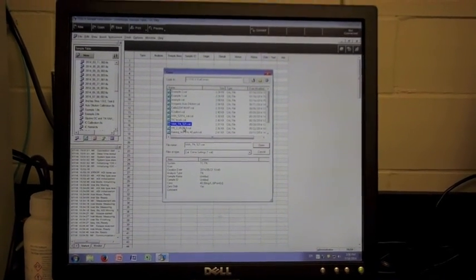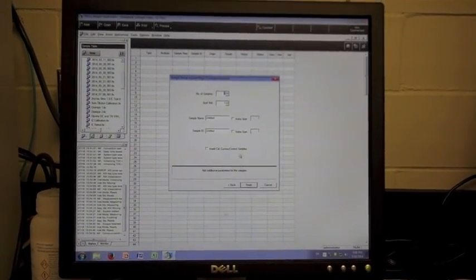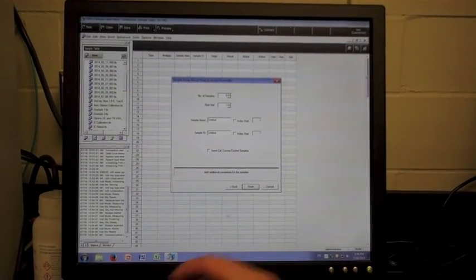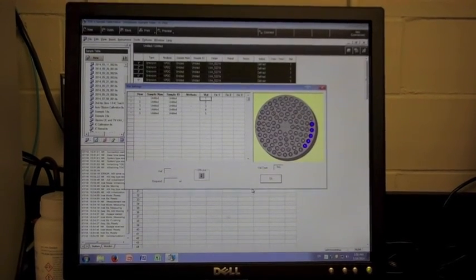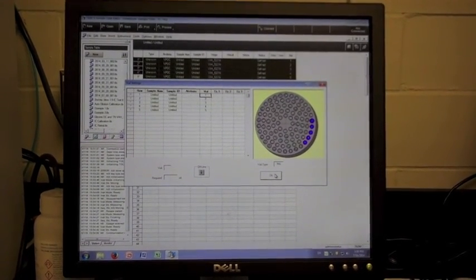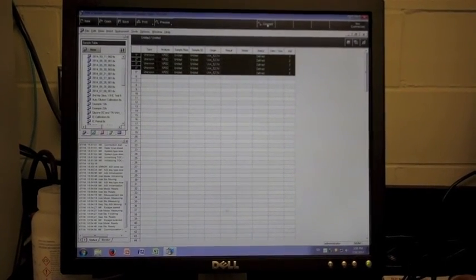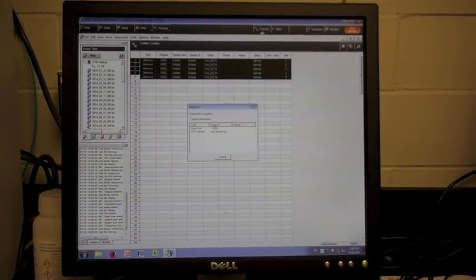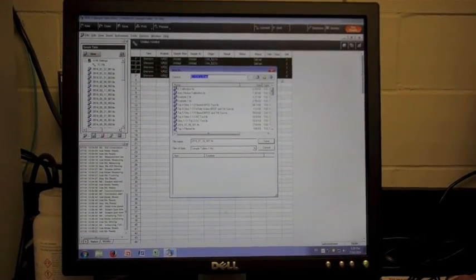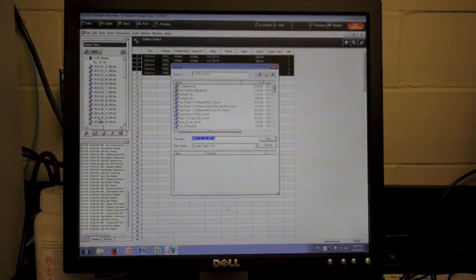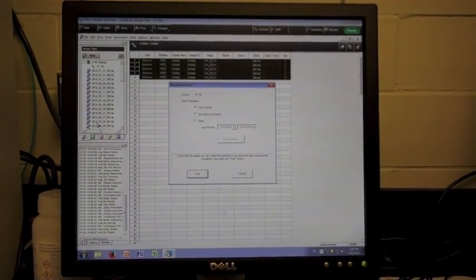Proceed to the next window and enter the number of sample vials and the vial number for which you began placing the vials. Ensure the vials are properly labeled by looking at the tray diagram. Reconnect the machine and the program, then select start. Once start is selected, save the program file and select an action for the machine once sampling is finished. The shutdown option is recommended once sample analysis is completed.